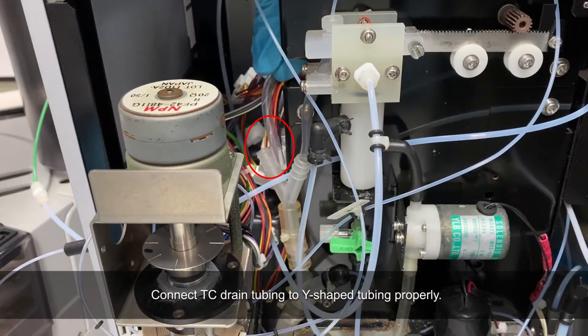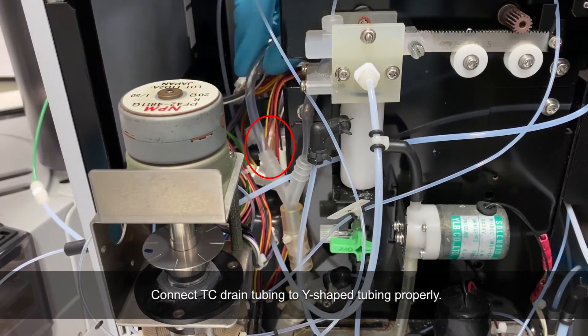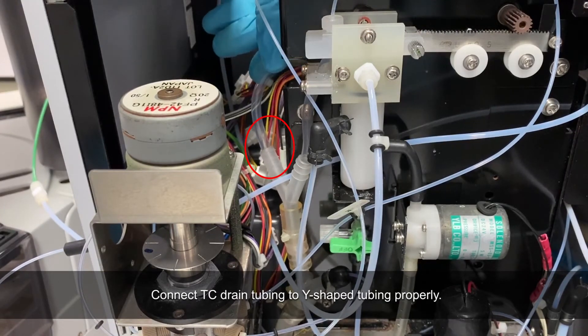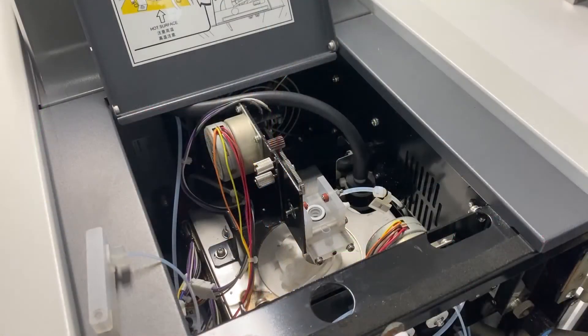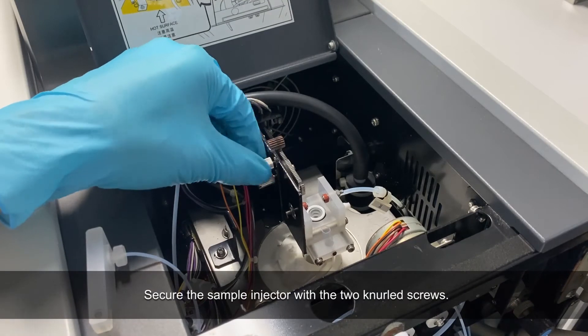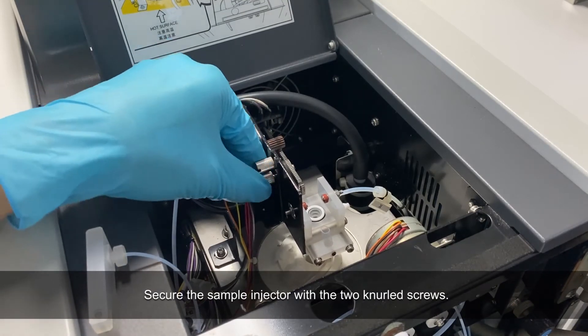Connect the TC drain tubing to the Y-shaped tubing properly. Secure the sample injector with the two screws.